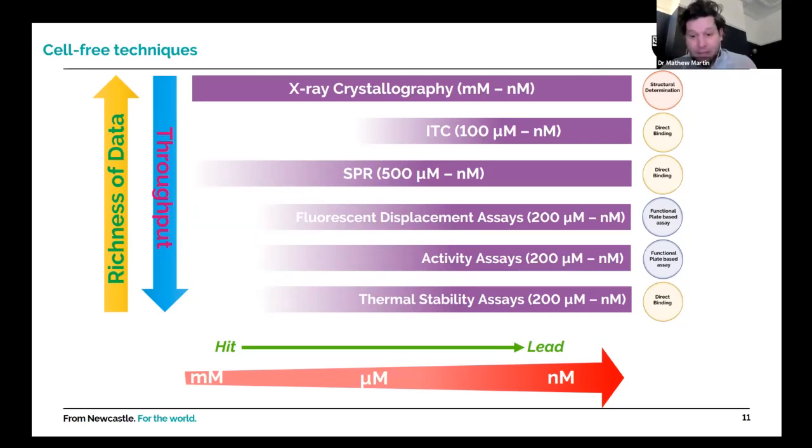You could start with a pragmatic, cheap and dirty thermal shift assay, for example, where your sample protein is the same as the construct used in crystallography, with the only prerequisite that you need it to achieve a stable melt curve. Or ITC with your current construct, also a wonderful option, seen as the gold standard for ligand interactions. For surface plasmon resonance, you can immobilize your current construct through amine coupling, but I believe that you're probably better served with a directional biotinylated tag, for example.